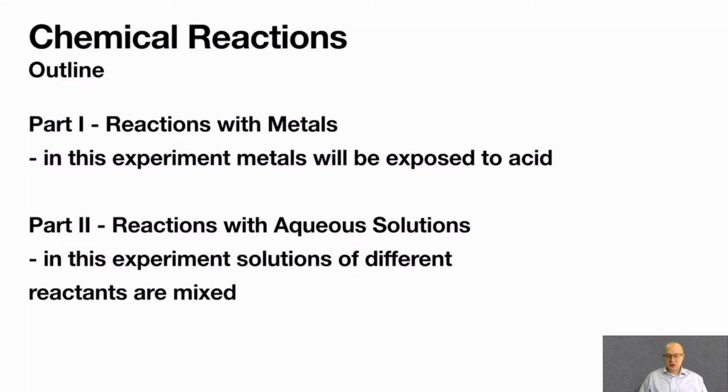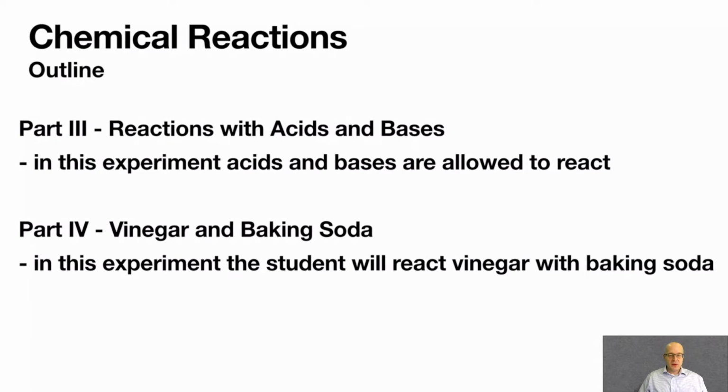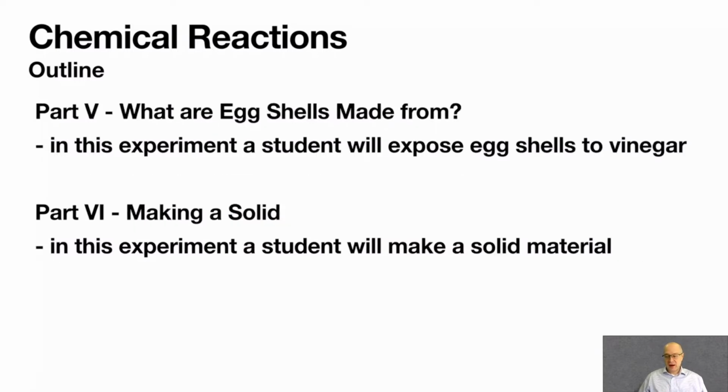Reaction with aqueous solutions is pretty fun. You see a lot of color changes and things like that. In Part 3, we'll do some reactions with acids and bases, and we'll see what happens there. In Part 4, vinegar and baking soda, a classic high school science fair experiment. It's also called the volcano reaction. In Part 5, we'll be throwing some eggshells in with vinegar and seeing what happens.